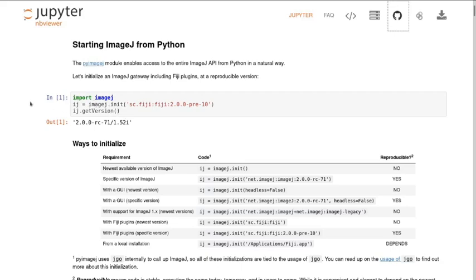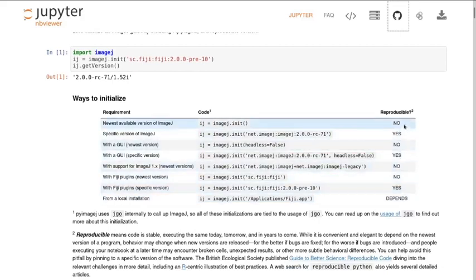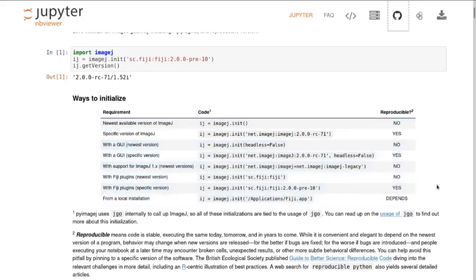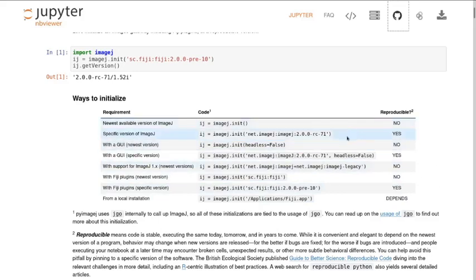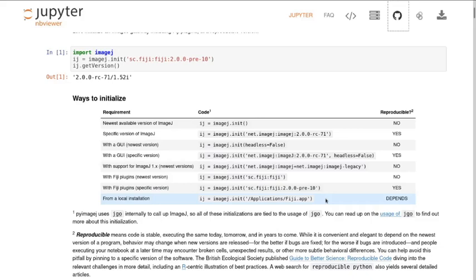So you can initialize with an online version, such as this. So this is initializing with a specific version of Fiji, but you can also initialize with your local installation, and that's really useful if you've got any fancy plugins installed because they might not necessarily be activated in the online version. However, the online version is really nice because you can send it to anyone in the world, and they'll have the exact same version of Fiji that's going to run all of the codes in your Python scripts.